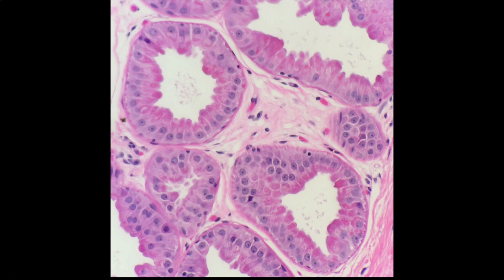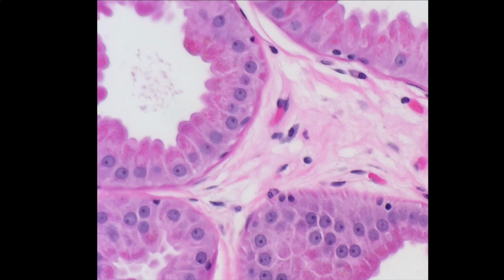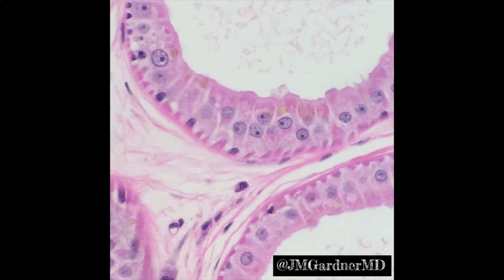Like I said, I really like apocrine glands. You're probably tired of hearing about them now, but you've come this far, so go ahead and keep watching. Here's a closer look. I think I took these with my iPhone, so they might be a slight bit blurry, but in general, iPhones take pretty awesome pictures just by holding it up to the ocular of the microscope. It takes a little practice, though.